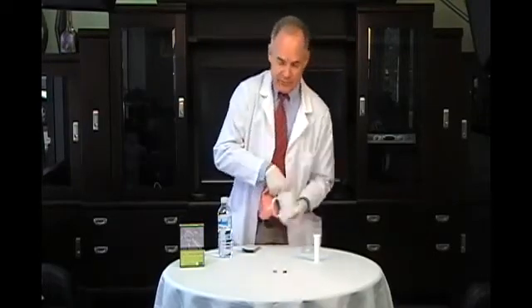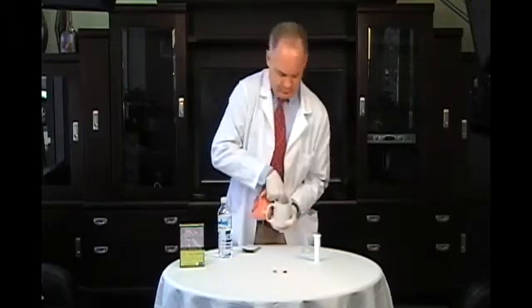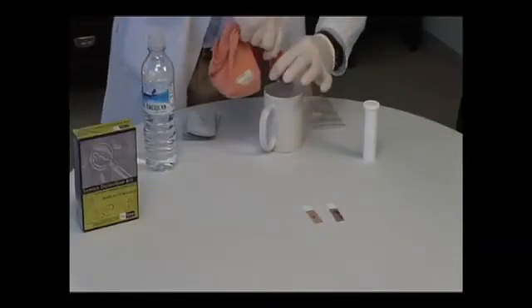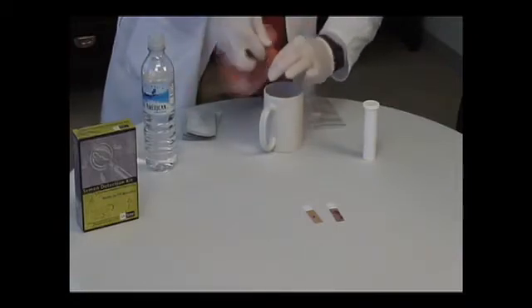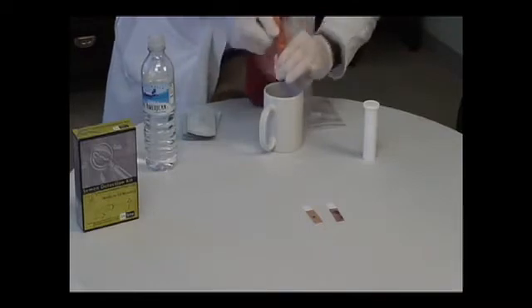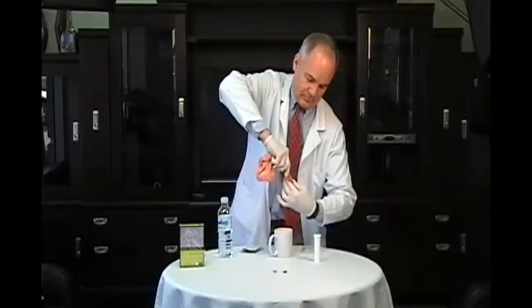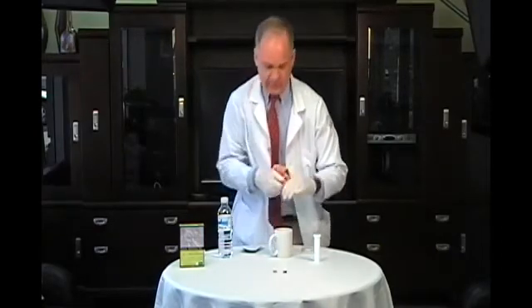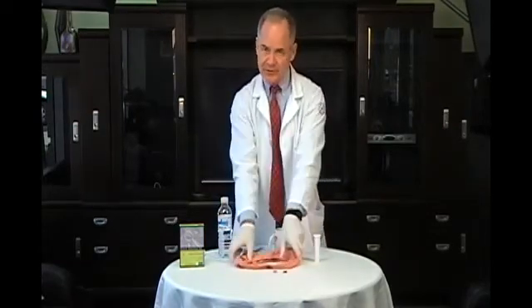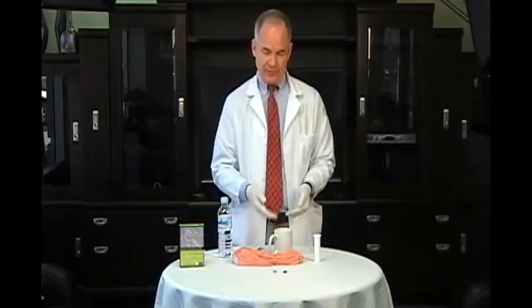Do this about 15 or 20 times. And when you finish doing it, wring out the underwear as well as you can into the coffee cup like this. There. Now this preserves the underwear so that you can wash it again and wear it. Some people punch holes in underwear and take out samples for analysis, but that's really not necessary. All you have to do is extract it into a coffee cup.